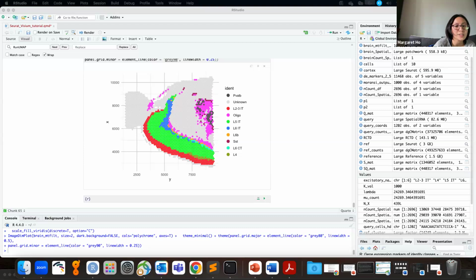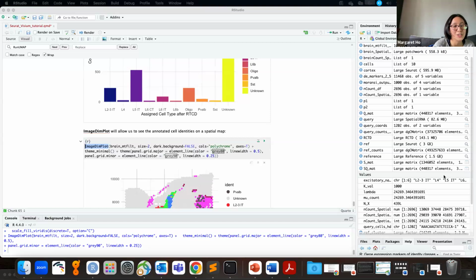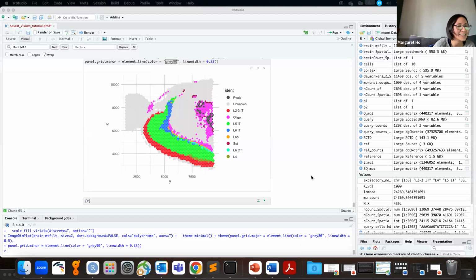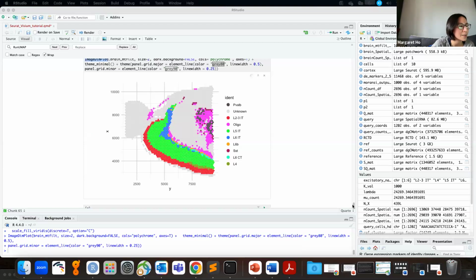Does Visium HD analysis differ much from Visium? I mean, it's definitely way higher resolution. The main thing that I've noticed with Visium HD is that it's just way, way bigger, so everything takes way, way longer. But yeah, it's very similar. You can do the binning in different ways, which allows you to control it. You're essentially getting way more cells.